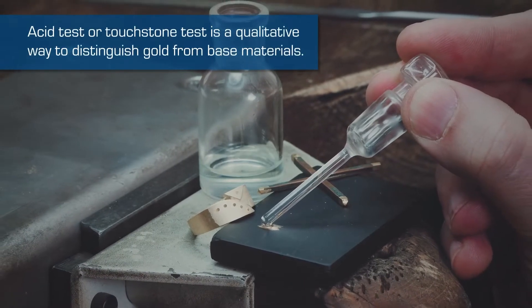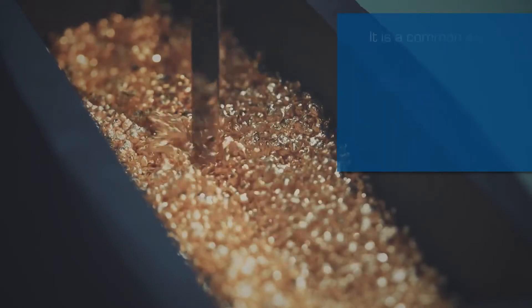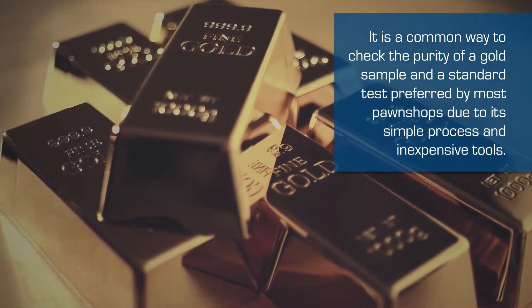The acid test or touchstone test is a qualitative way to distinguish gold from base materials. It is a common way to check the purity of a gold sample and a standard test preferred by most pawnshops due to its simple process and inexpensive tools.